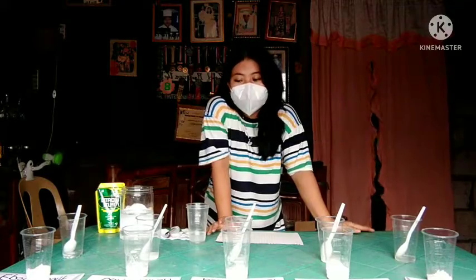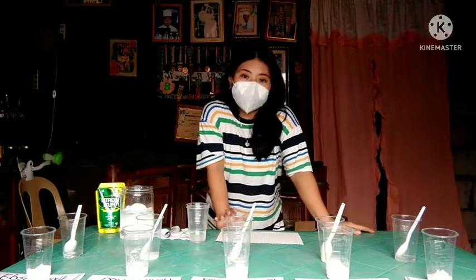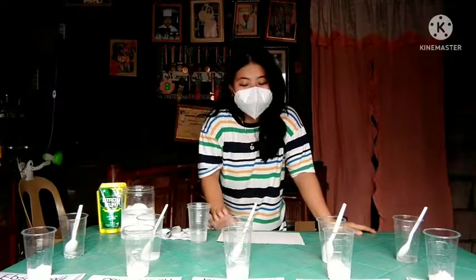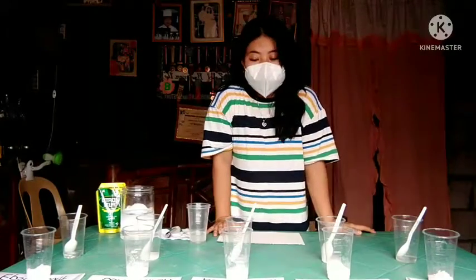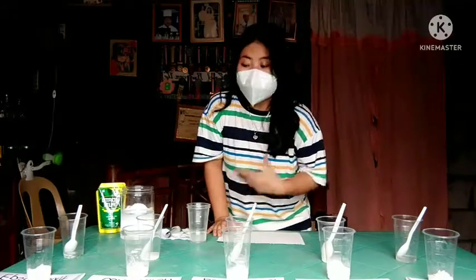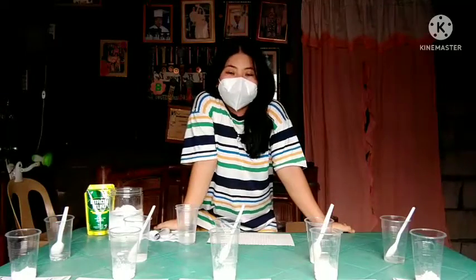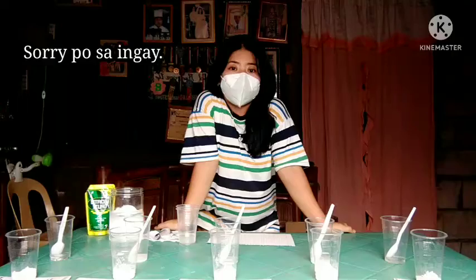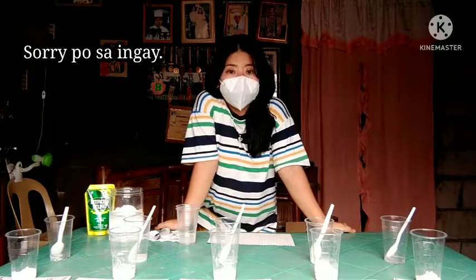When we put vinegar, ang i-record natin is kung ano or aling chemicals ang nagproduce ng gas. So, let us put 10 drops of vinegar in each solution. Ang equivalent ng 10 drops is 0.5 ml.